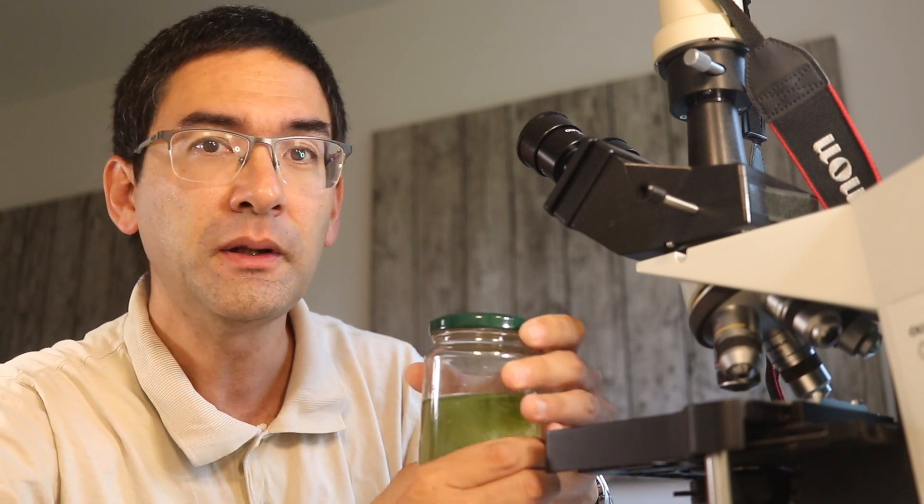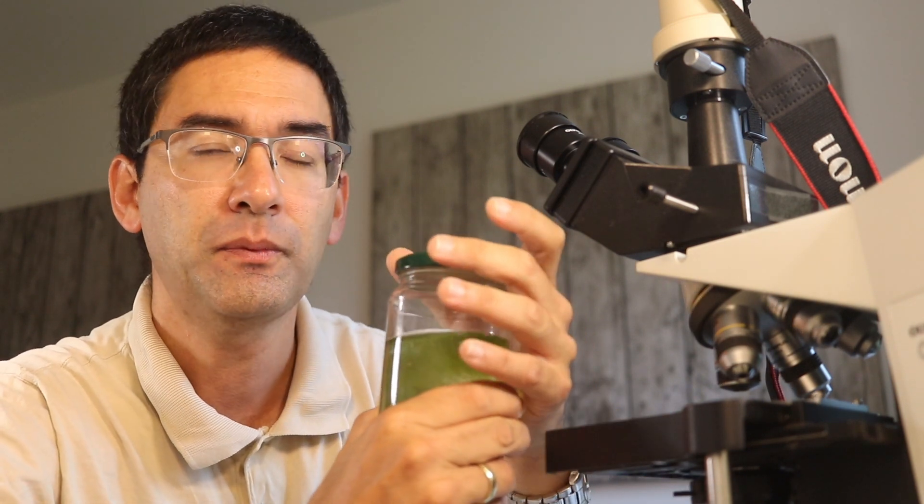If water evaporates, you have to replenish it a little bit. Don't wait until too much water has evaporated and then add too much at once. Always add a little bit at a time, because the water you add has a different concentration of minerals and other compounds, and this causes an osmotic shock to the microorganisms. Adding little by little means they don't experience too radical a change in water quality. Essentially, what you're doing is trying to keep a mini aquarium.